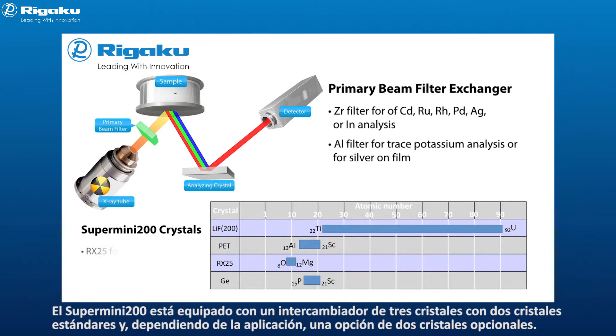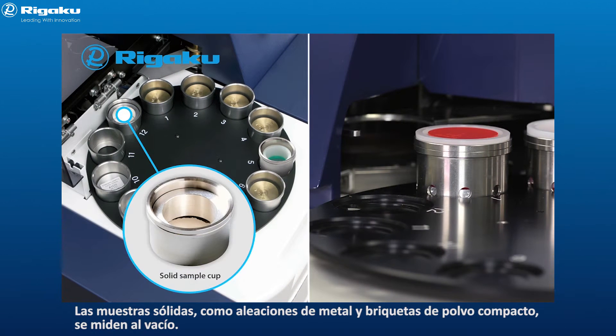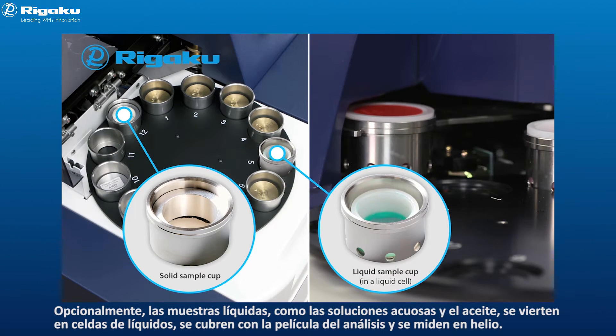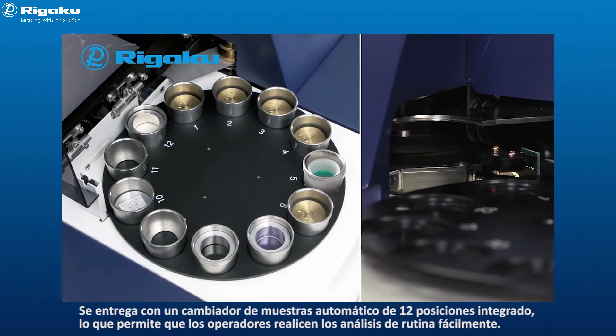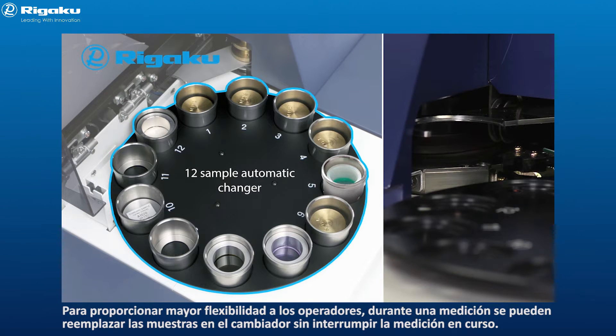The Supermini 200 is equipped with a three-crystal exchanger with two standard crystals, and depending on your application, a choice of two optional crystals. Solid samples such as metal alloy and pressed powder briquettes are measured under vacuum. Optionally, liquid samples such as aqueous solutions or oil are poured into liquid cells, covered with analysis film, and measured under helium. A 12-position automatic sample changer is standard, enabling operators to carry out routine analysis smoothly. For added operator flexibility, during a measurement you can replace samples on the changer without interrupting the ongoing measurement.